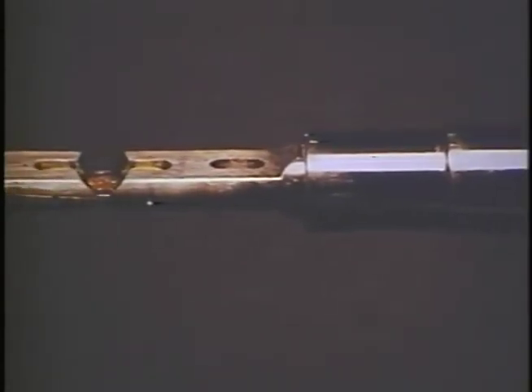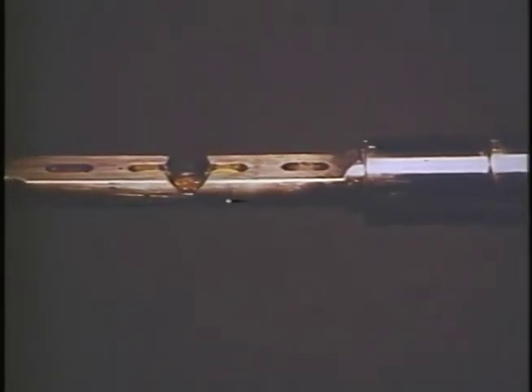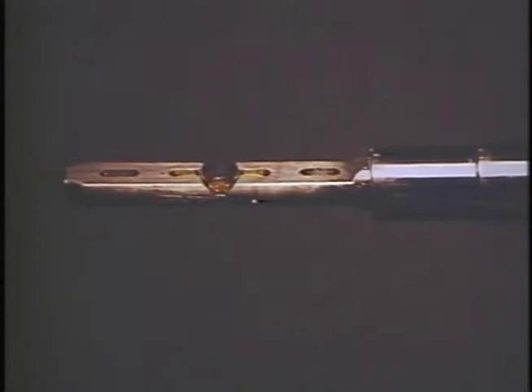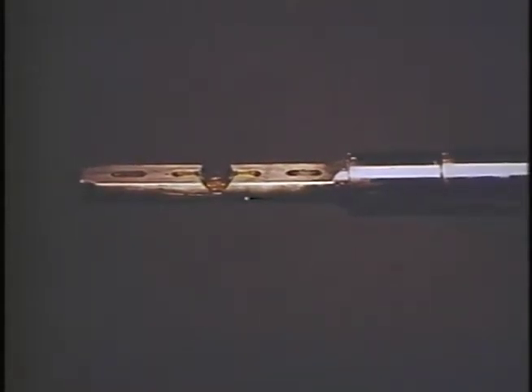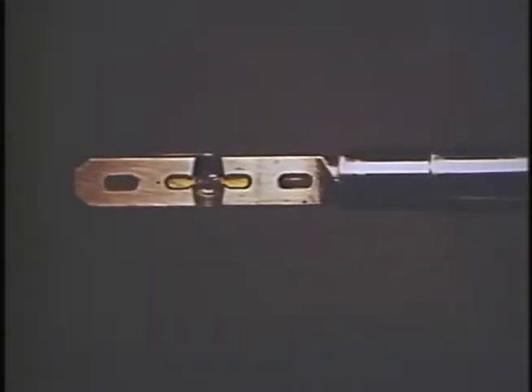The next stage is to collect very high tilt data, because the limitations in resolution of the reconstruction depend not only on how many views you take, but how much of the angular space you can cover. Towards this end, we've developed, again as a joint design effort between our groups and Gatan, a very high tilt stage for the Philips microscopes. This is an iridium tip with a very steep cutout showing where the grid is. That allows you to tilt to very high angle.